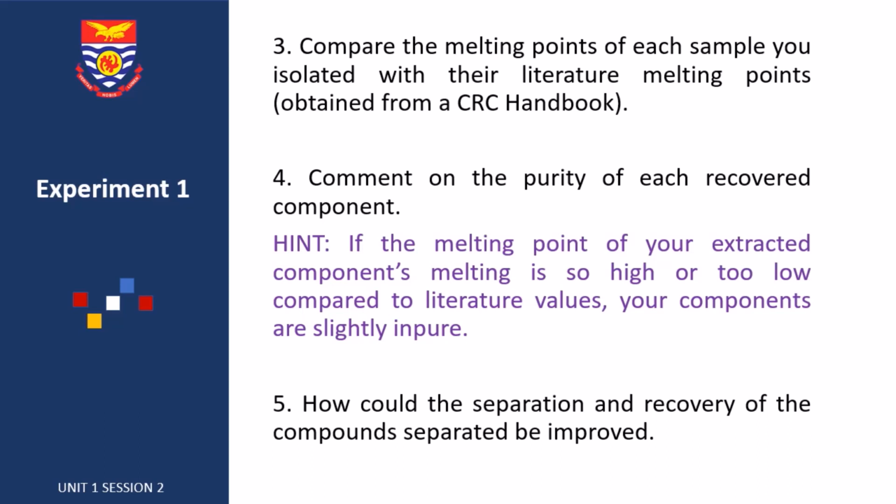So you have to know the standard compound's melting point, and then you compare the melting point of your extract as well. One thing you have to know is if the melting point of the extract or the component you are able to obtain from the experiment is too high or too low from literature values, then it means your extract is slightly impure. So you have to take note of that.